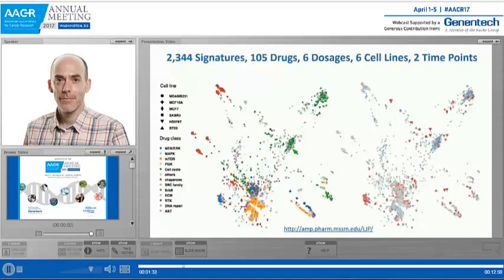This is a collaboration between the Broad Transcriptomics Center, the HMS LINCS Center, and we've contributed this type of visualization. It's an interactive website that you can go to. On the right, you have the cell viability measured for those cells. In blue are the cells that are dying due to the drug treatment, and in red, you actually see an increase in proliferation of those cells. So some cell lines, for some of those drugs, escape the killing and actually increase their proliferation.